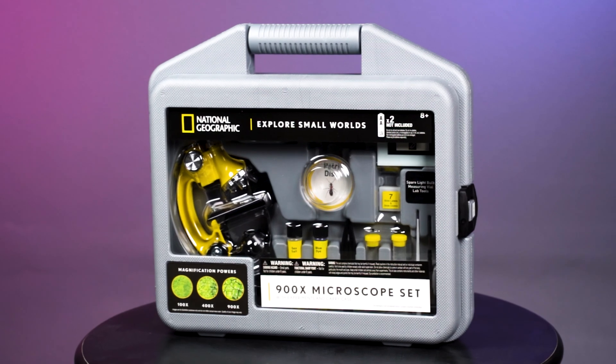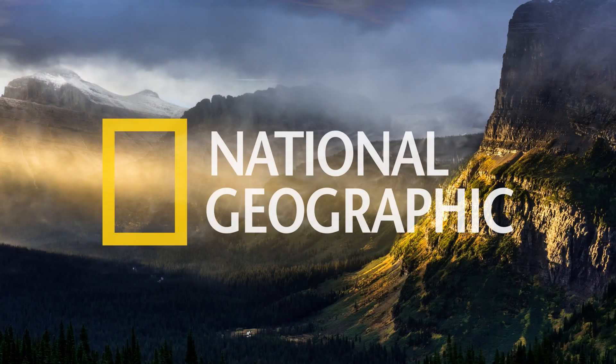Get your hands on the National Geographic 900x Microscope and start exploring today. Get something new.